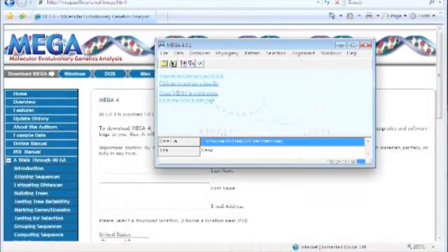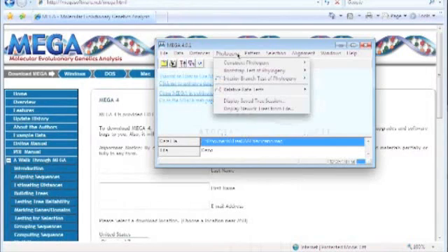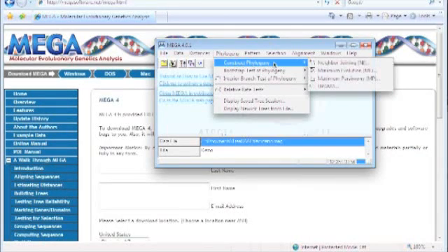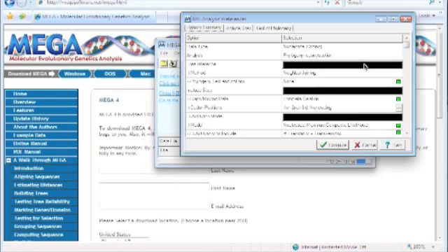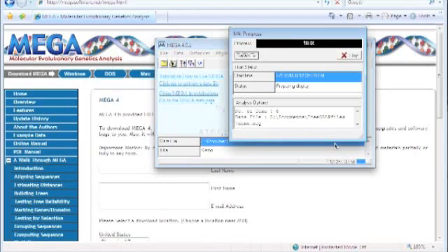The next thing we're going to do is create a phylogeny, which basically is going to represent the relationship between the species. So if you go to the Phylogeny menu, select Construct Phylogeny, you can do any of these — we'll just use a simple neighbor joining — and run that.